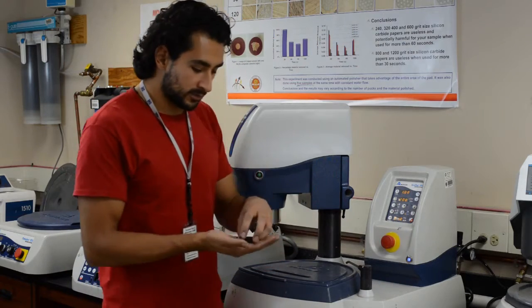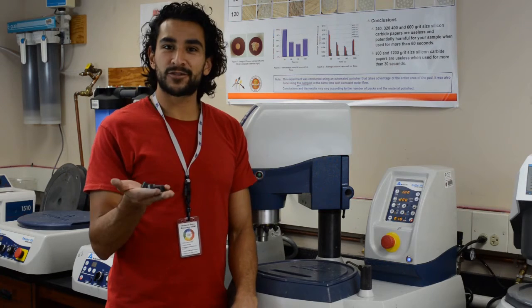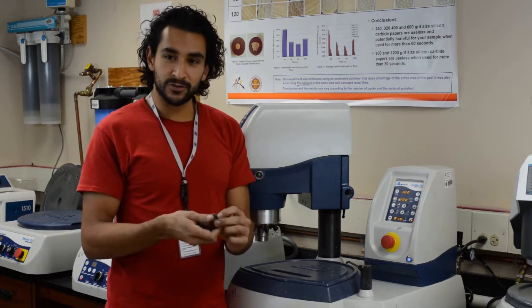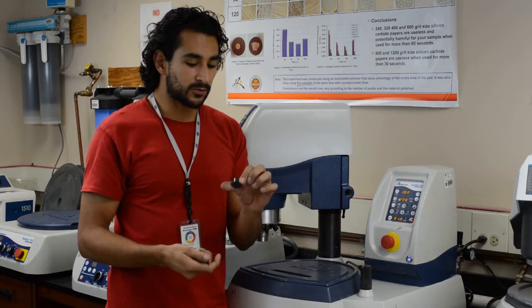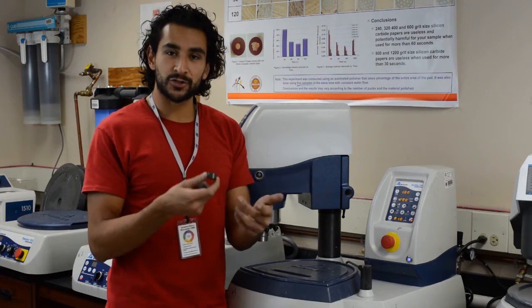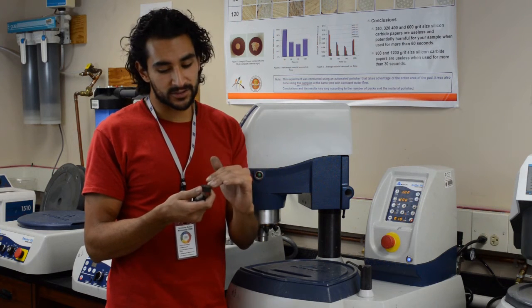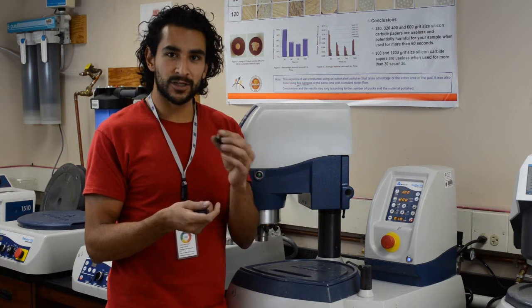I'm done for now. Today we've only done one grinding step — all we did today was mount and do one grinding step. Some other day, we will do the rest of the polishing steps, and I'll show you pictures of how this progresses from these really bad, scratched-looking cross-sections to much finer and better looking cross-sections.